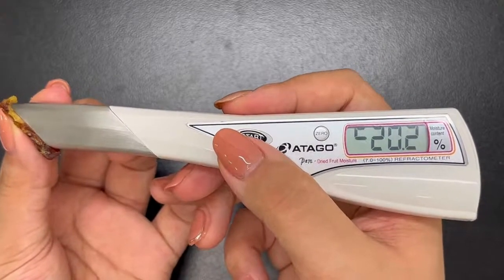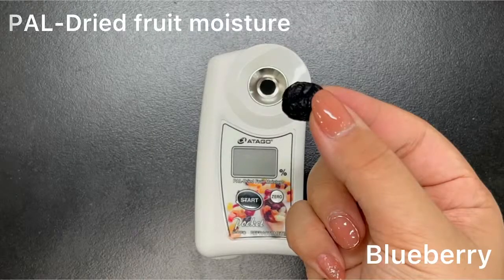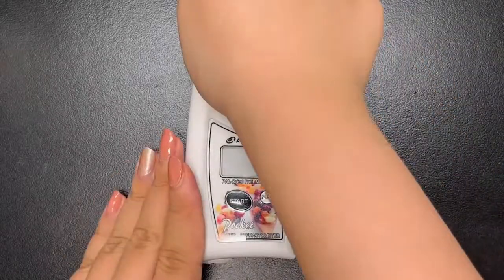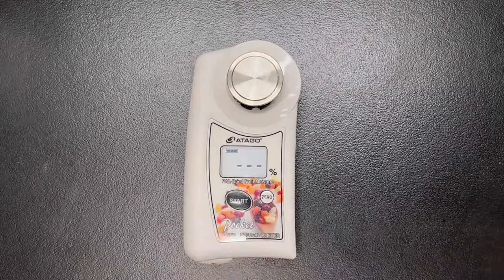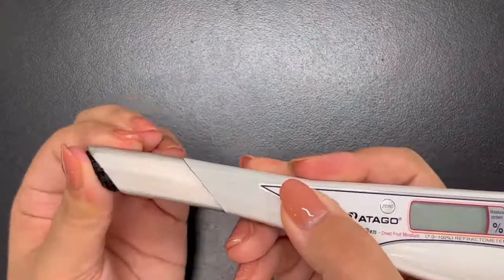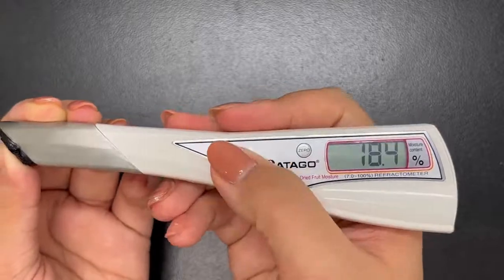As you can see here, we are now measuring dates using the PEN. The dark color of the dates doesn't affect the measurement, since we are measuring water content. By taking several measurements, we can confirm that all the readings are stable. This is the end of the measurement video.